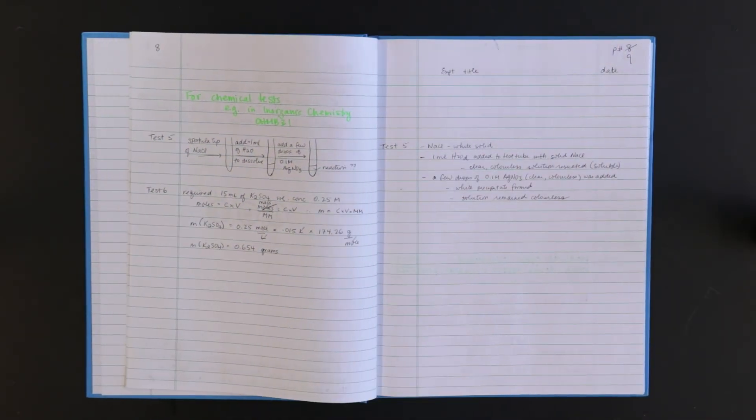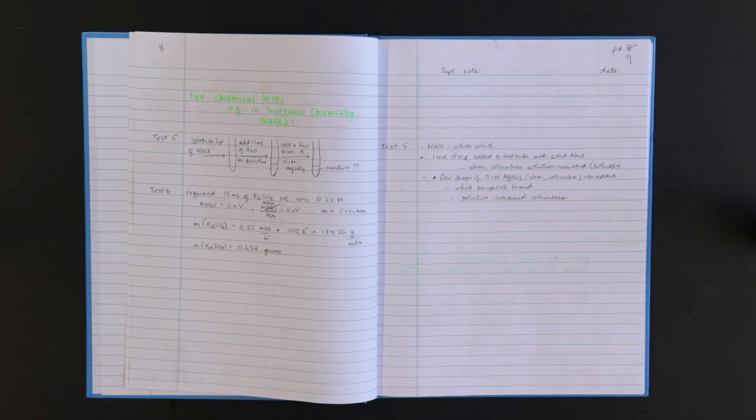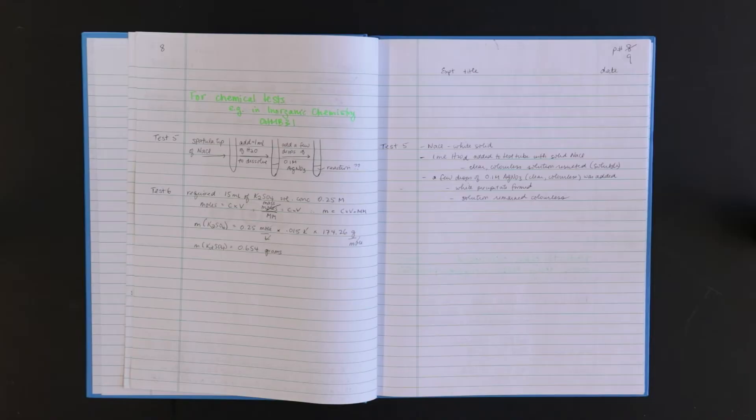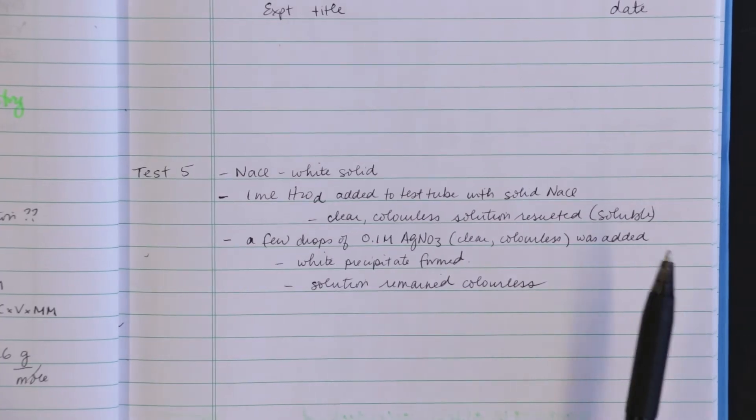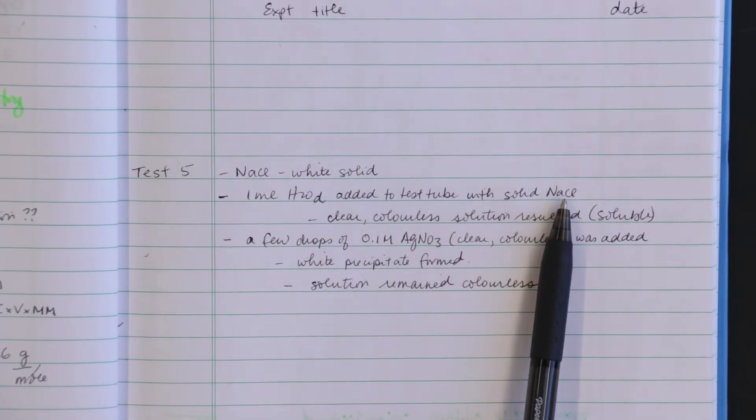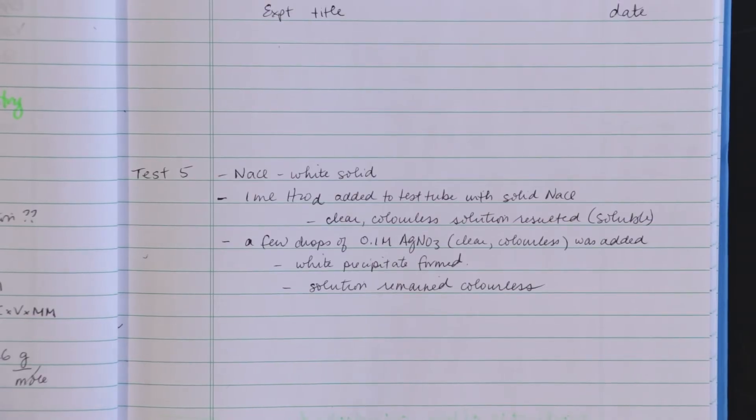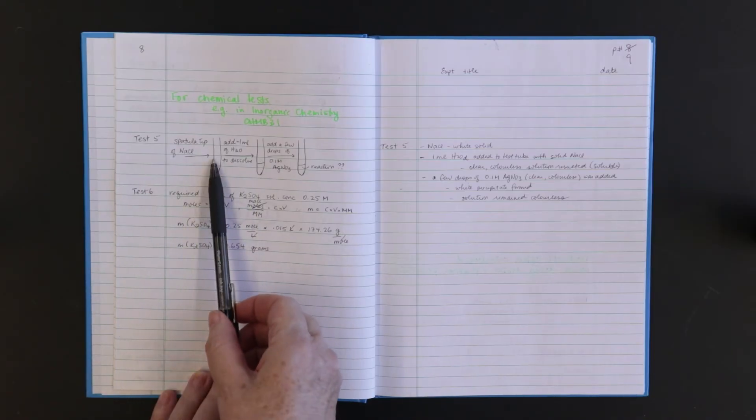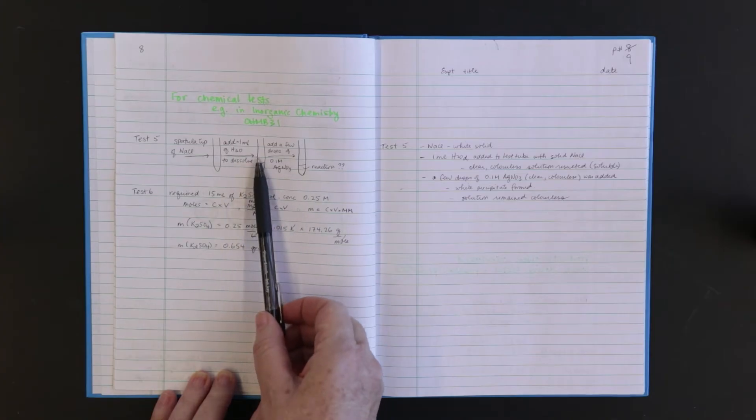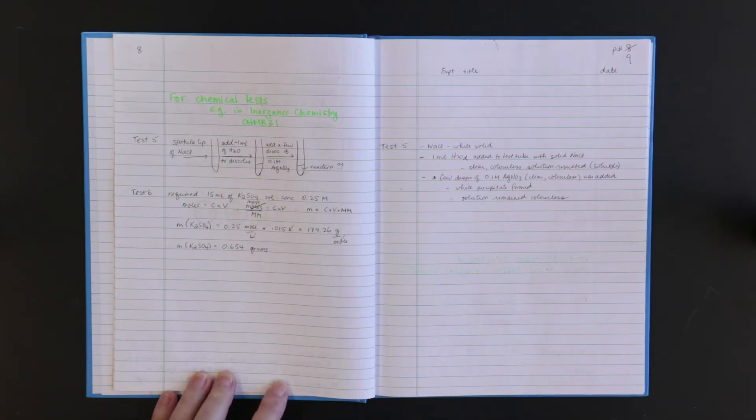In this case I'm showing a flow chart for a series of tests such as you will see in the inorganic chemistry course Chem B31. So for this test I have my plan and directly opposite on the right-hand page I have what was physically done in the lab with my observations. Pre-lab questions are answered on the left-hand page. In this case it is asking you to calculate the mass of a compound required for specific concentration and volume. Always show your units.